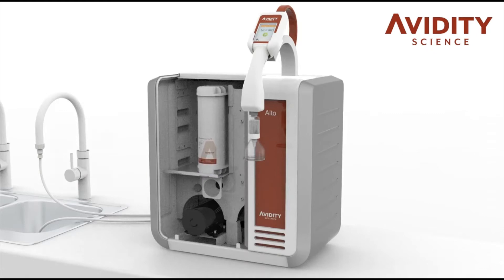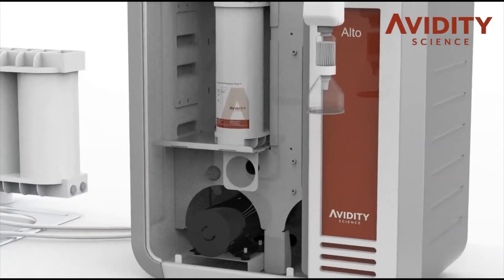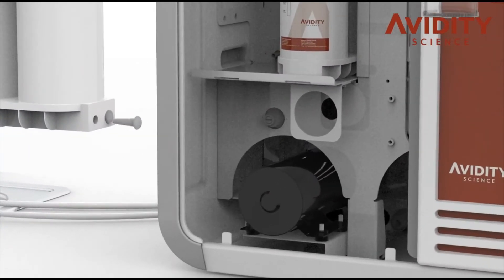Remove the plugs from the sanitisation pack and insert in the left hand position and follow the on-screen guide to complete the sanitisation procedure.